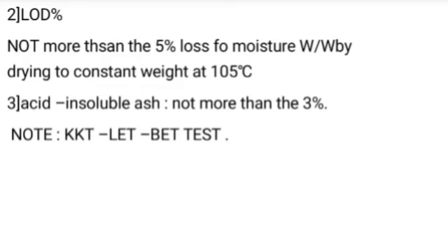For cardiac glycosides we are doing the Keller-Kiliani test, Legal's test and Baljet's test. How should we remember them? Try remembering in a picture form, so that it may be easy. And one more thing, while you remember the Keller-Kiliani test, remember that we mostly use chloroform, then glacial acetic acid, then ferric chloride, and again sulfuric acid. So this is how you remember the Keller-Kiliani test.